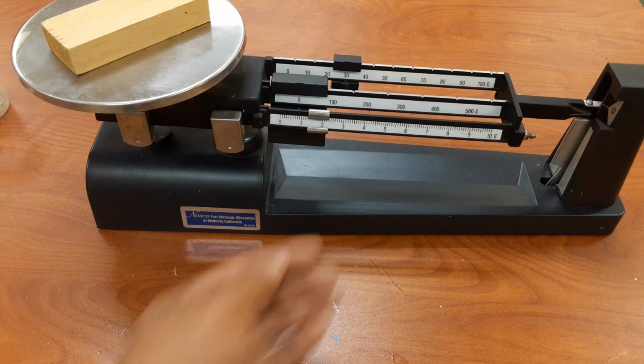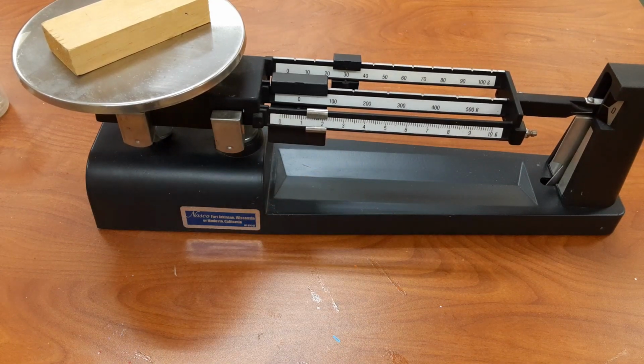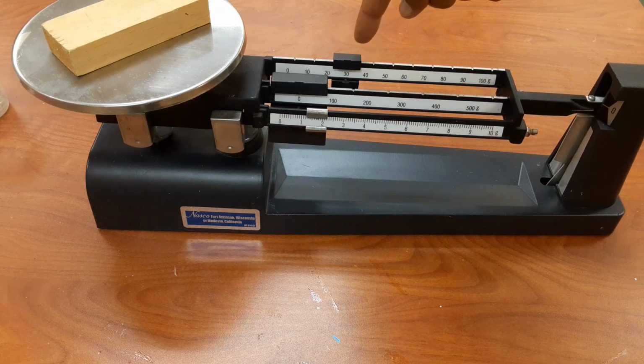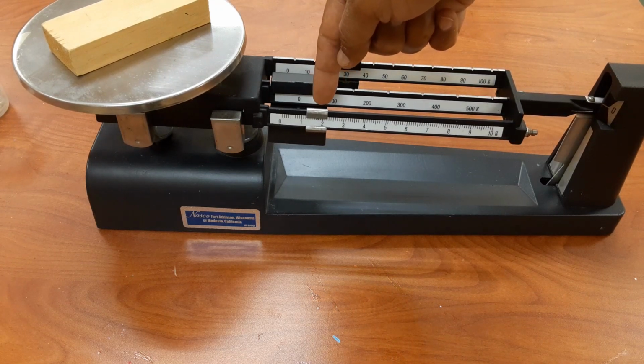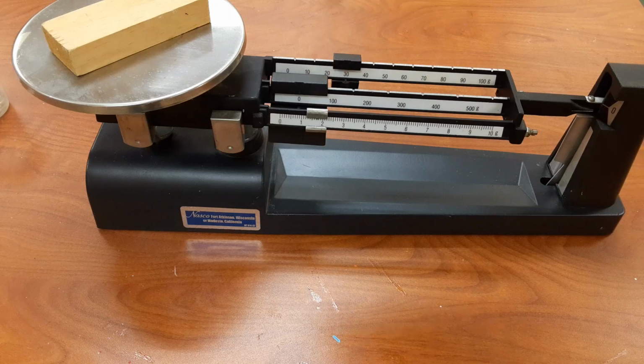So now you can see that the beam is actually horizontal, and on the last beam it says 30 grams, and on this front beam it says 1.7 grams. So I would add 30 and 1.7, so the mass of this block is 31.7 grams. So now you can divide the mass of this block by the volume of the block to get its density.